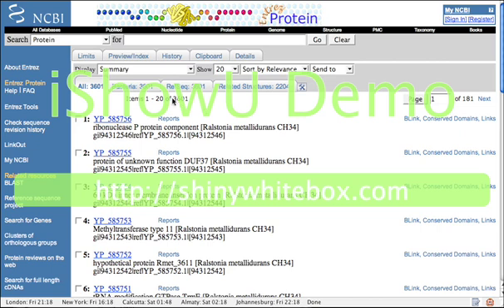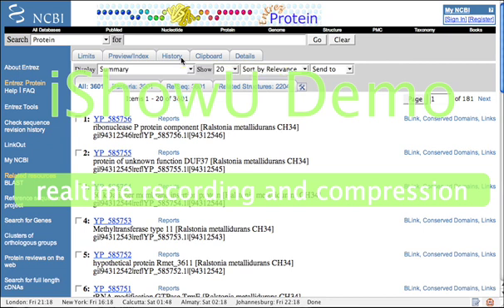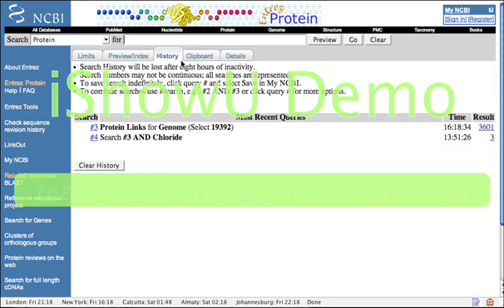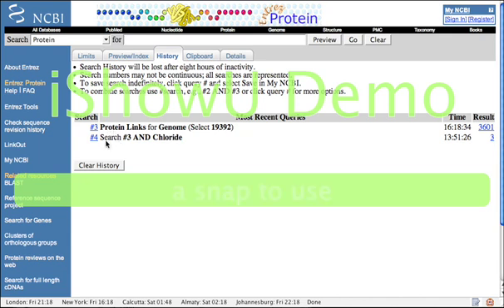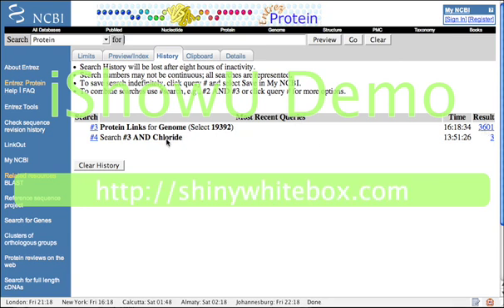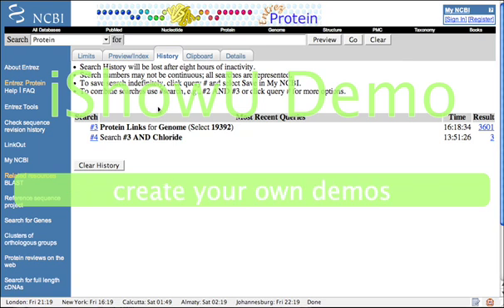What we basically get is a list of all 3,601 proteins in Cupriavidus metallidurans. If one now looks at the History tab, which is another useful feature, you see basically the searches we did. The current search is basically 3,601 protein entries for the genome that we are interested in cloning out of. And now is a very powerful feature, which is combining searches.